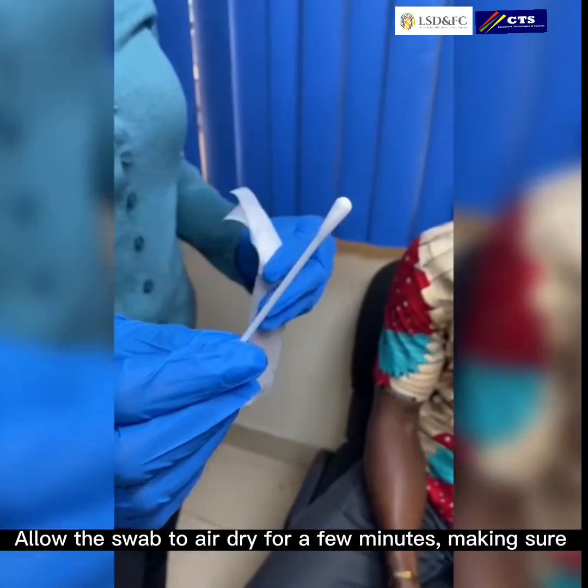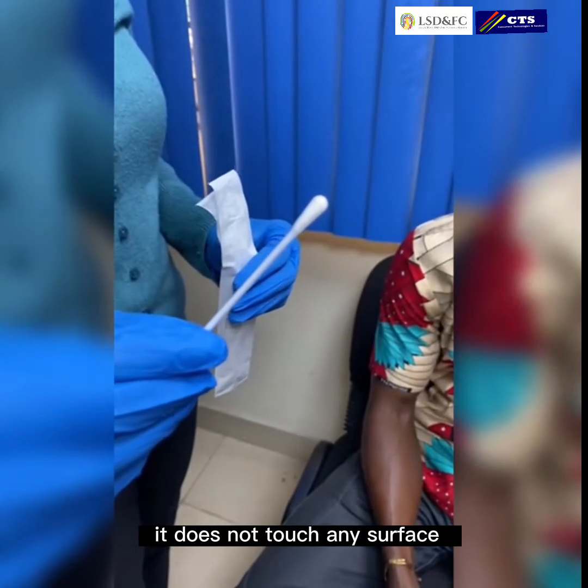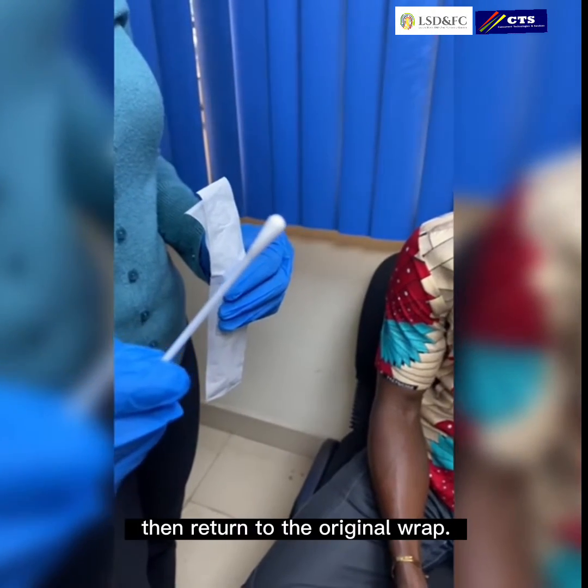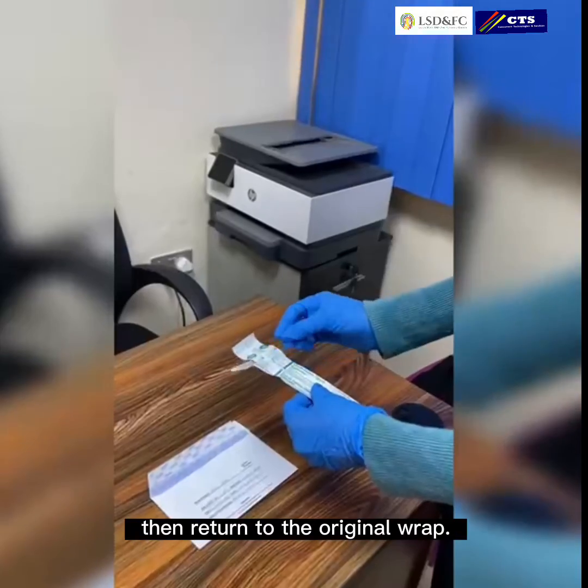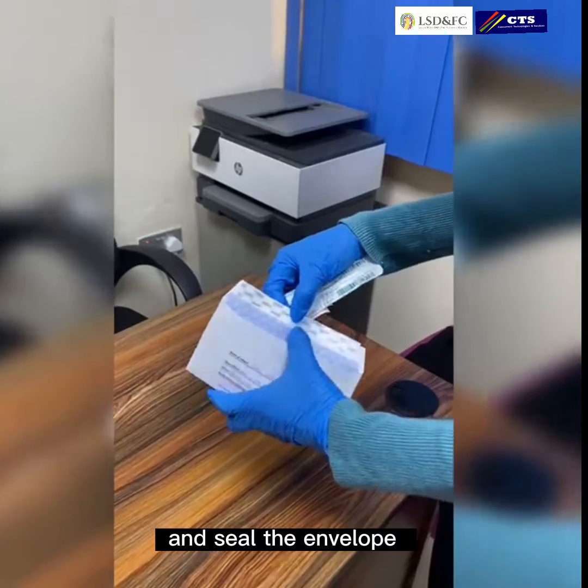Allow the swab to air dry for a few minutes making sure it does not touch any surface. Then return it to the original wrapper. Place the swabs in the properly labeled collection envelope and seal the envelope.